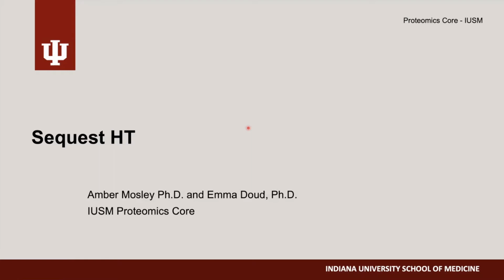And we're going to talk to you today about SEQUEST HT. This is the main database search algorithm that we use for the majority of the proteomics core projects. We're going to give you a little bit of an overview of how the search algorithm works, and then we're going to tell you about some of the key settings and basically how we make a decision on how to set those settings.